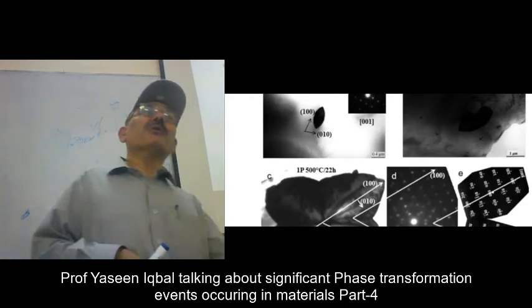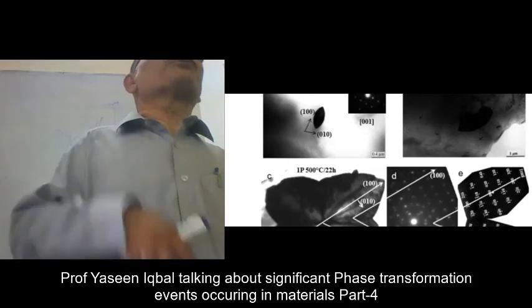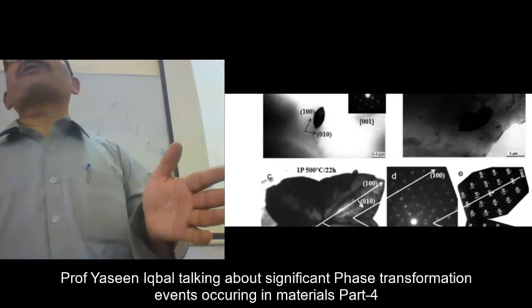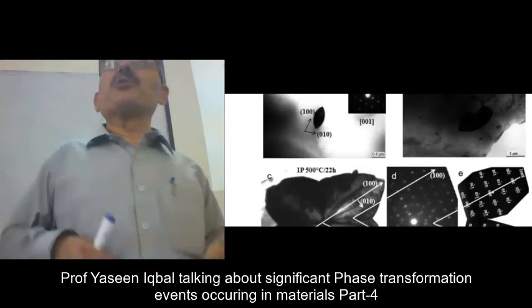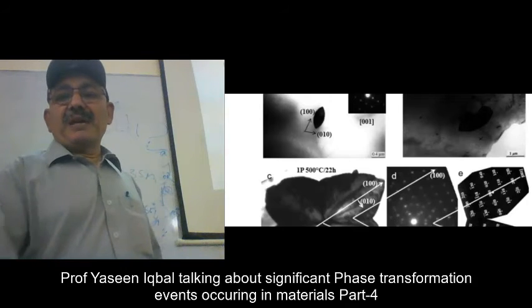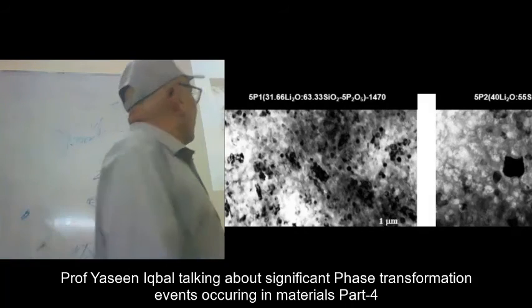It is showing you 4 angstrom, 4.5 angstrom. So everything is wrong, because between 4 angstrom and 4.5 angstrom, there may be a lot of other parameters. And your result will not be explainable by scientific logic. So always try to use calibrated equipment.